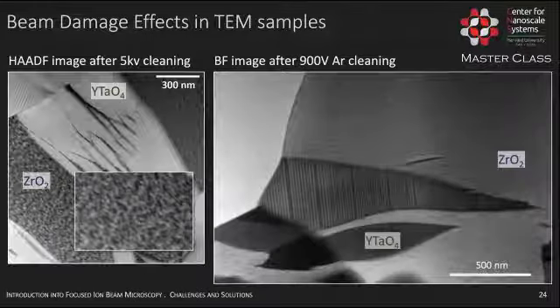An example where this was necessary is work that I have done with Mahesh Gangishetty in the Congreve lab at the Rowland Institute. He's working on organic-inorganic hybrid perovskite LEDs. Here we knew from X-ray diffraction data that the perovskite structure was made up of particles of the order of 20 nanometers.